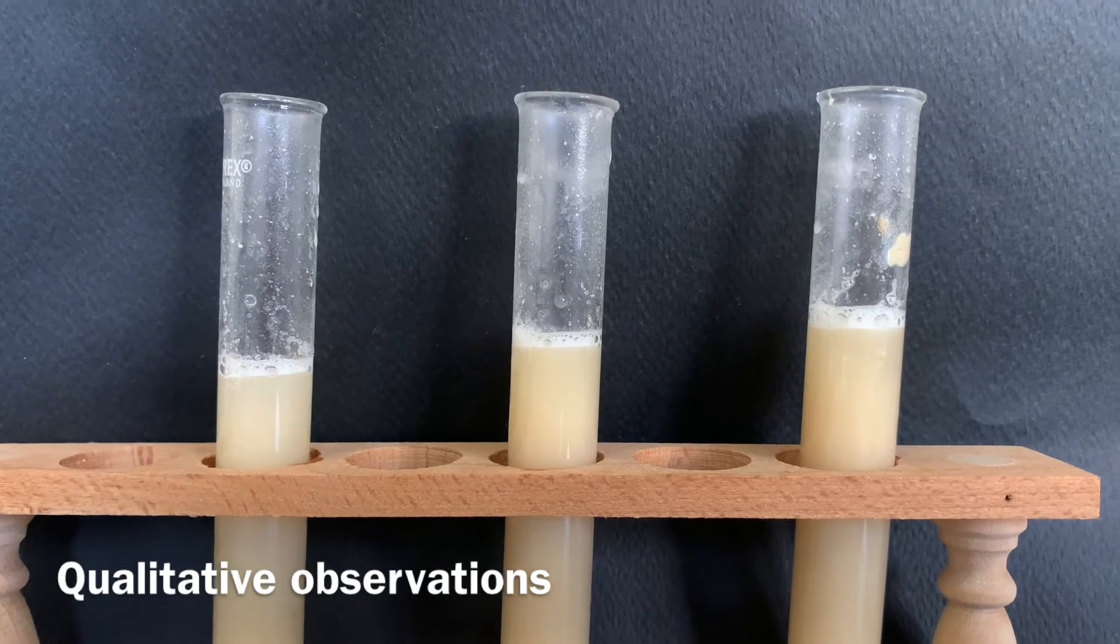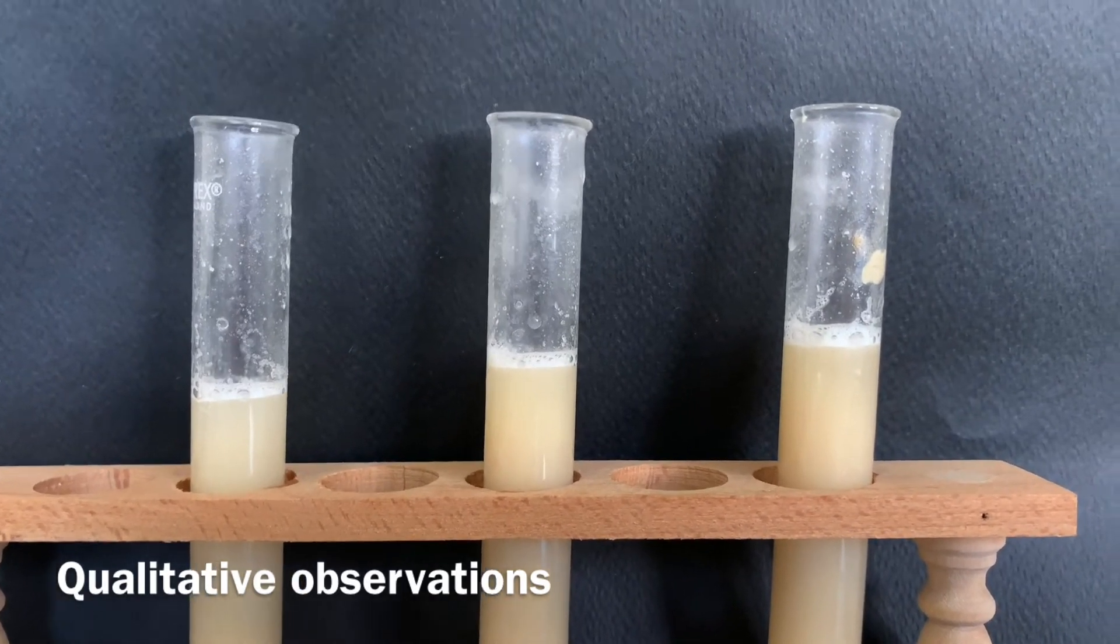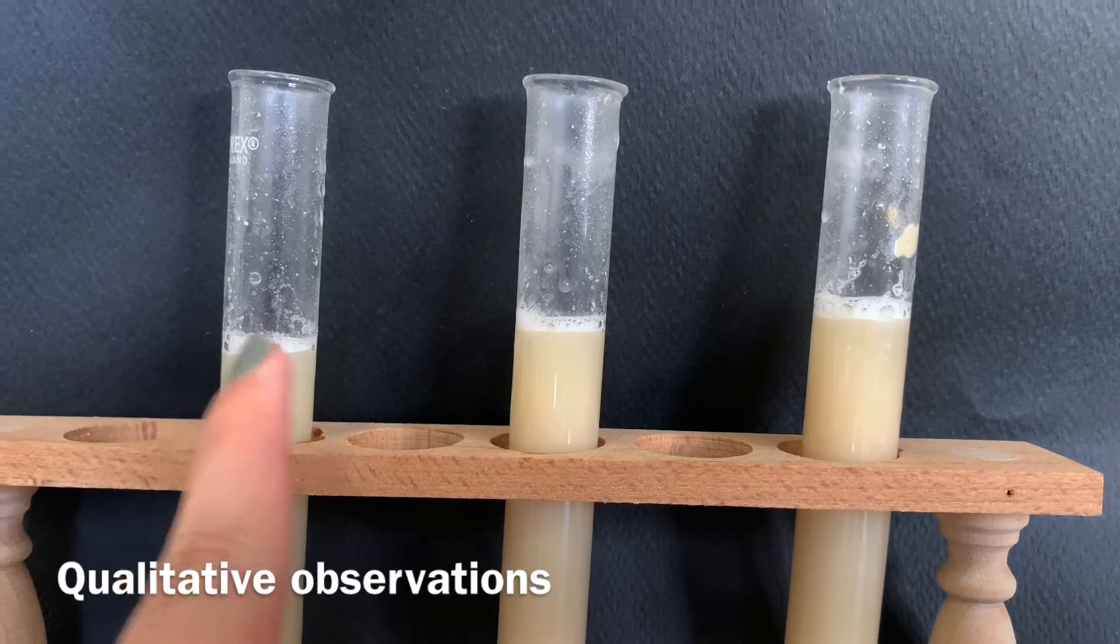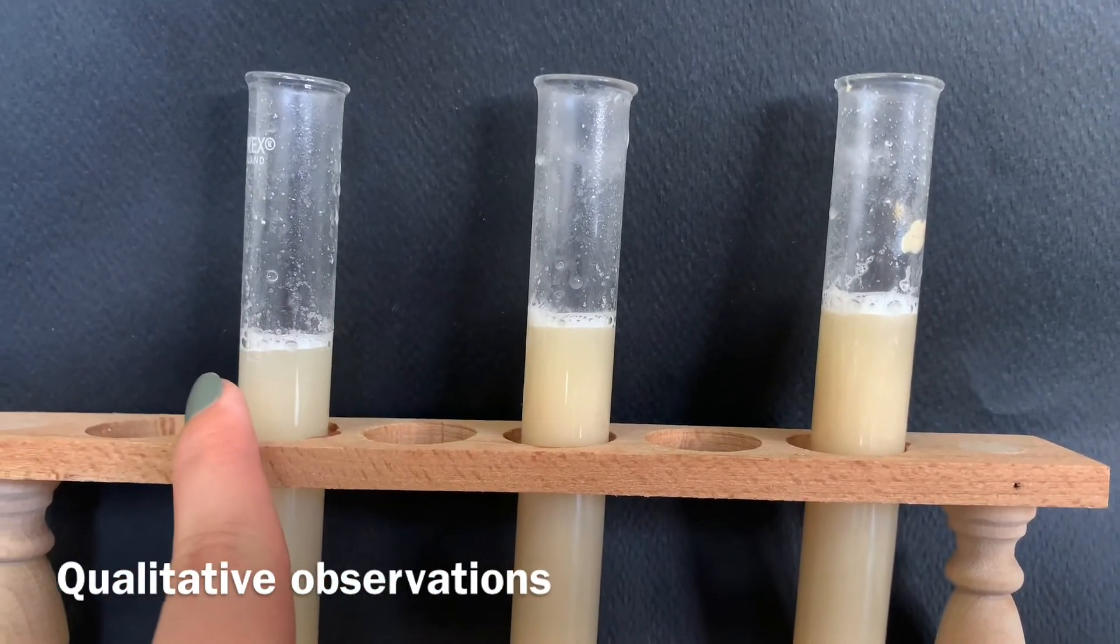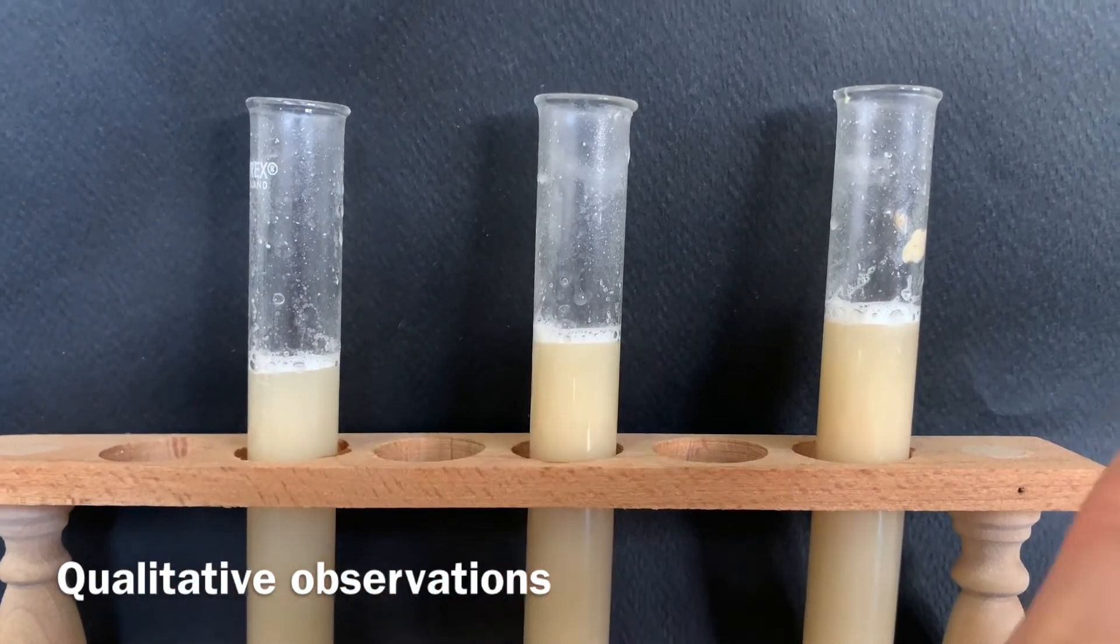Right away, qualitatively we can observe that there's a lot less bubbles produced in the first test tube which had no sugar, compared to the second and third which had one teaspoon and three teaspoons of sugar.